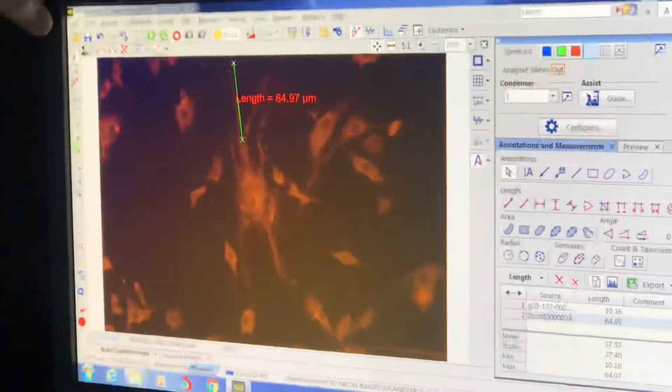At the same time, if you are interested in zooming a bit and seeing, we have a magnifying glass here on the left side. Press this one. Bring the magnifying glass on the image. Press left click.